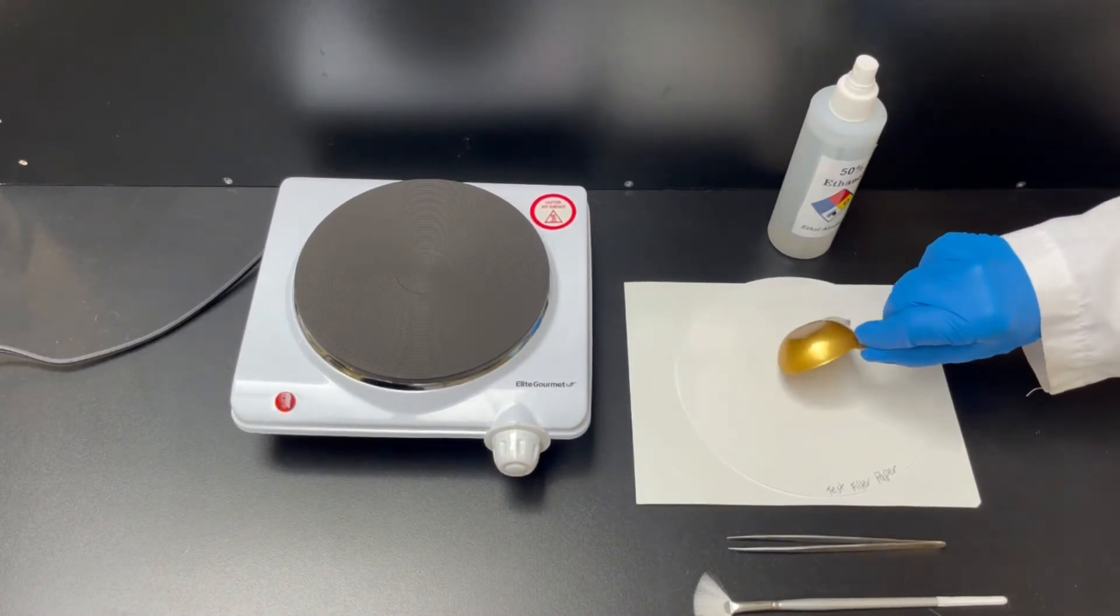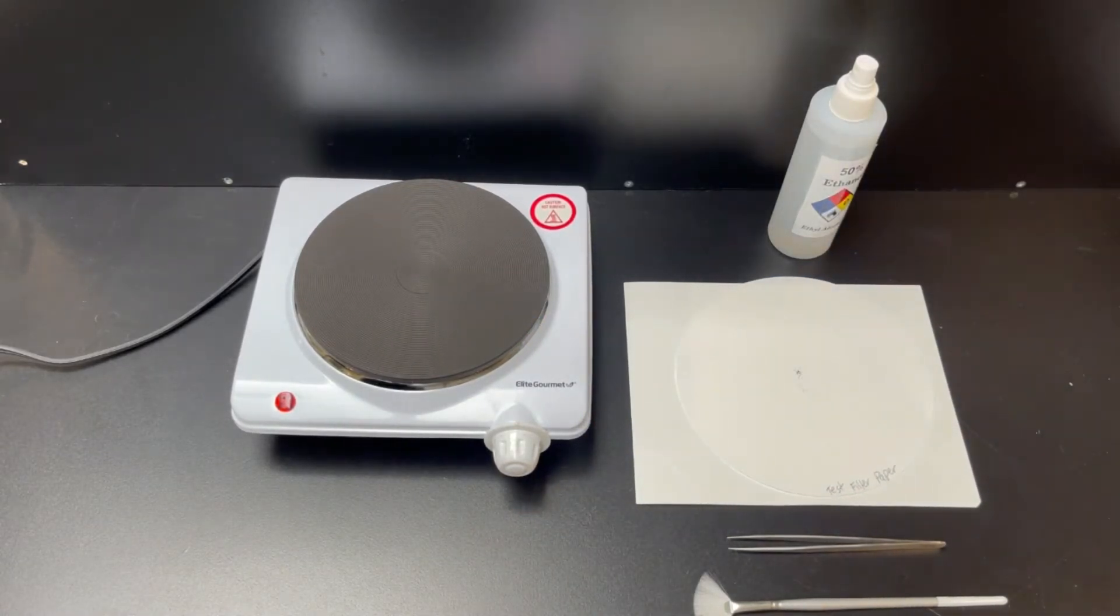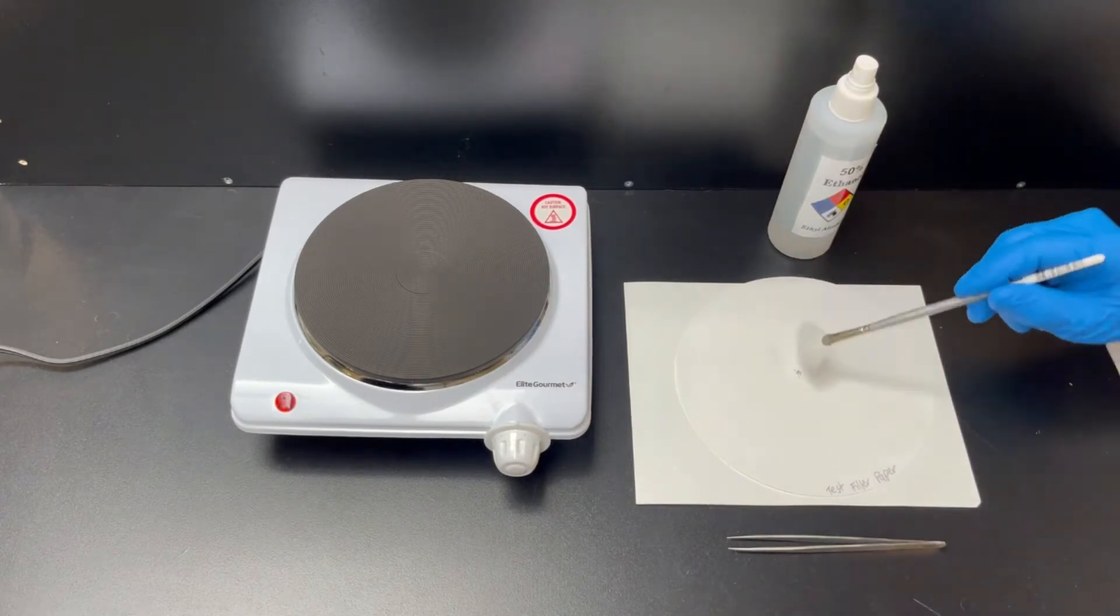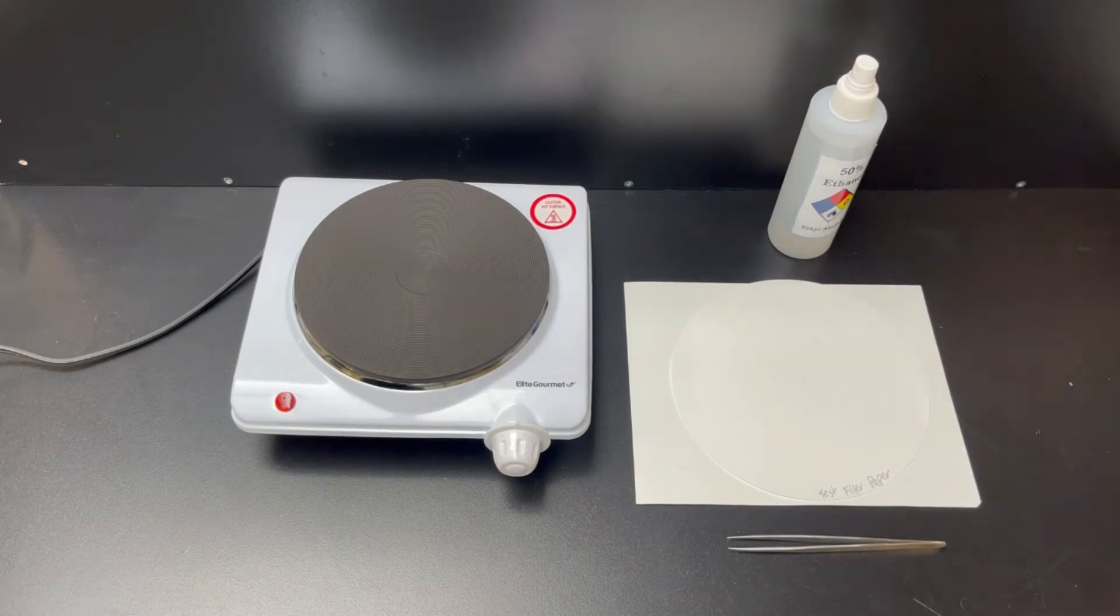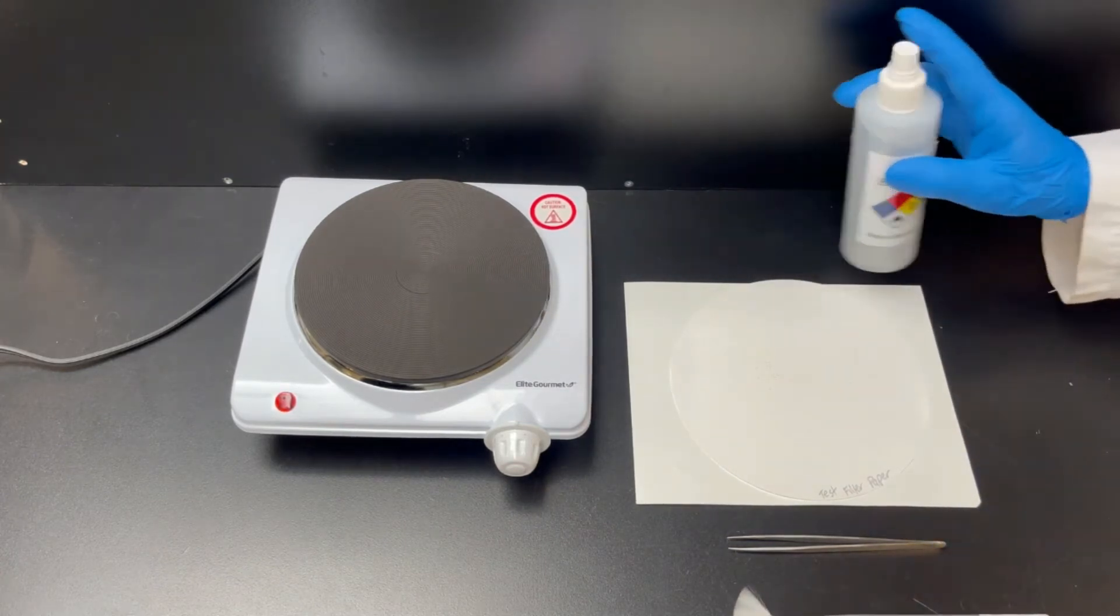Spread the Microtracer particles evenly onto an 18-centimeter filter paper using the artist fan brush. Use a spray bottle or misting device to disperse developing solution onto the filter paper.